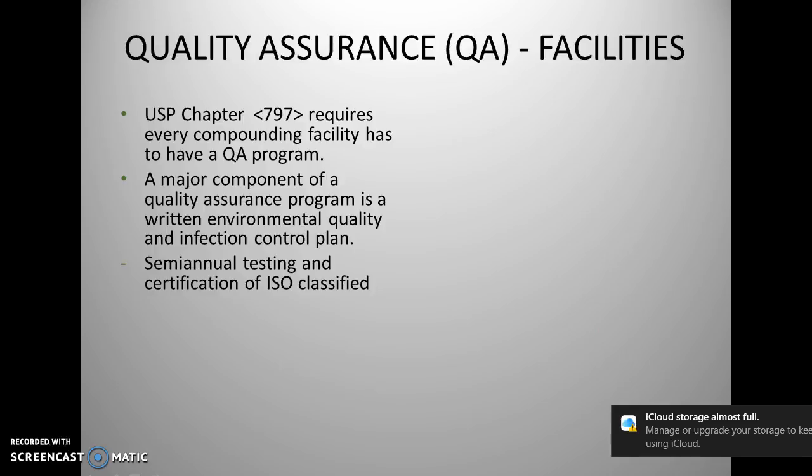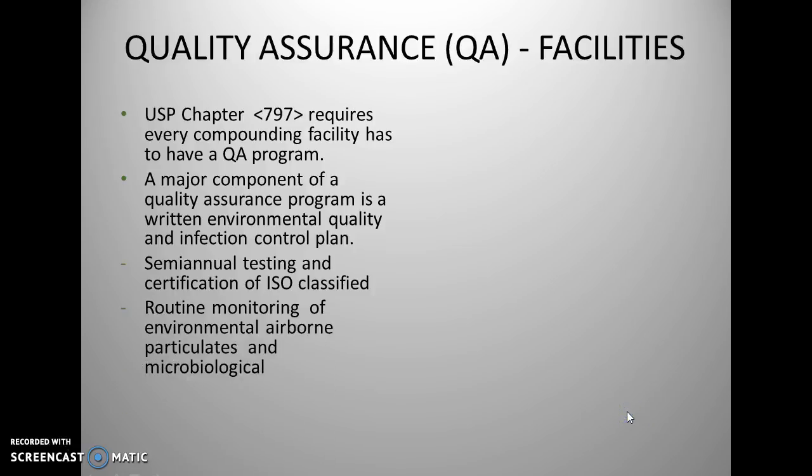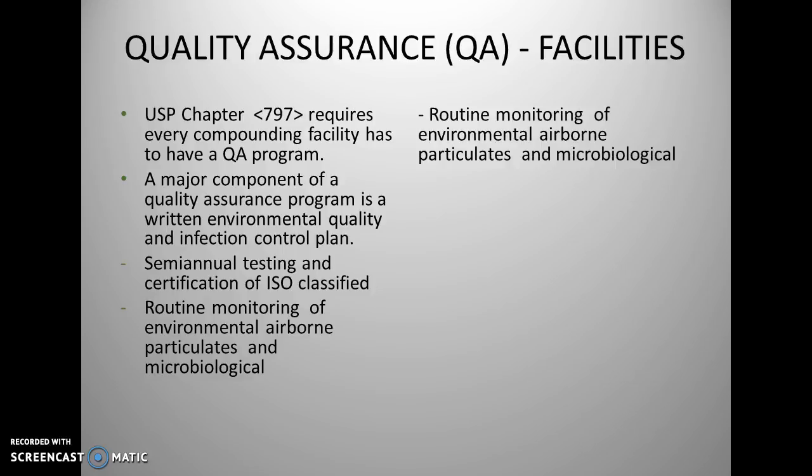And then there are inspections. Semi-annual testing and certification of the ISO classification must occur at least every 6 months. Routine monitoring of environmental airborne particulates and microbiologicals. Routine monitoring of operation temperature and humidity. So that's very important.